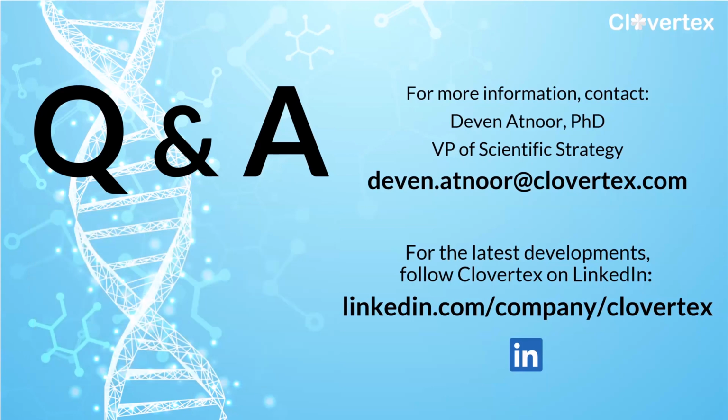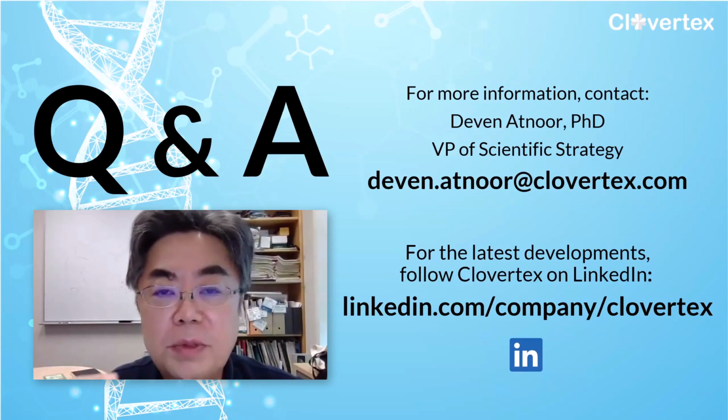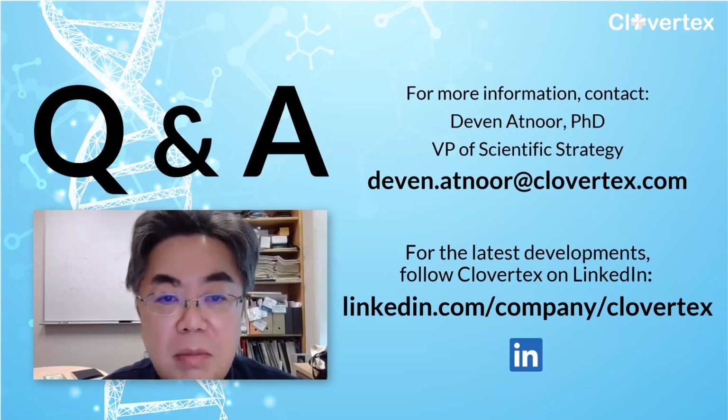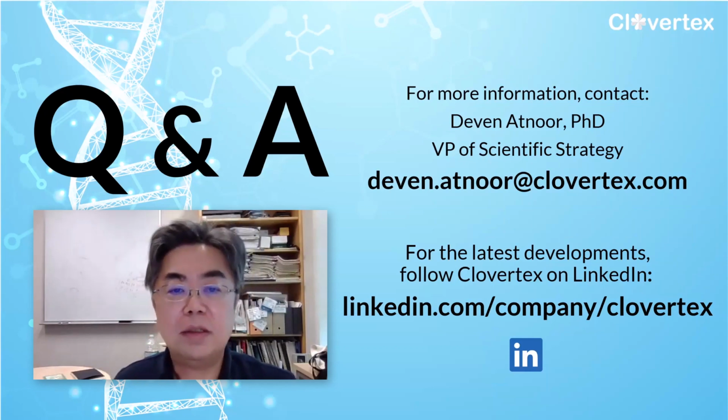Got it. Here's another question from Debu. What do we need to do to get a demo of the platform? Okay, so if it is only for the protein modeling part, my part, our lab has a website to do the modeling, and you can come over and test it. We have the source code made available, so you can also download and test it. We can help you to do it.